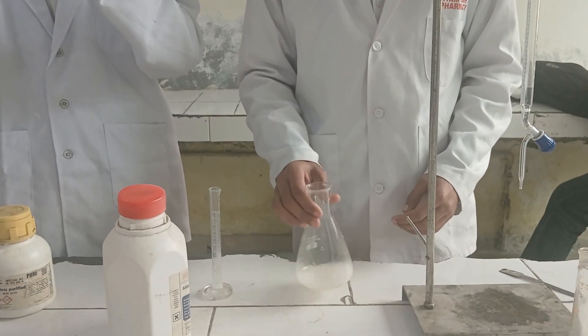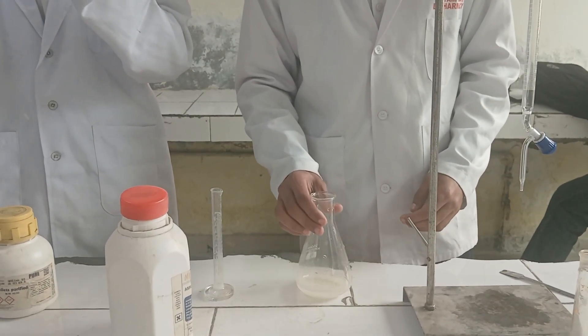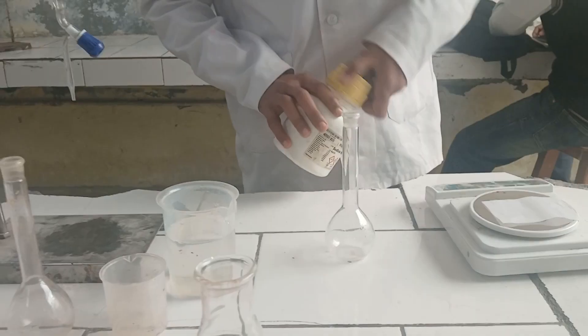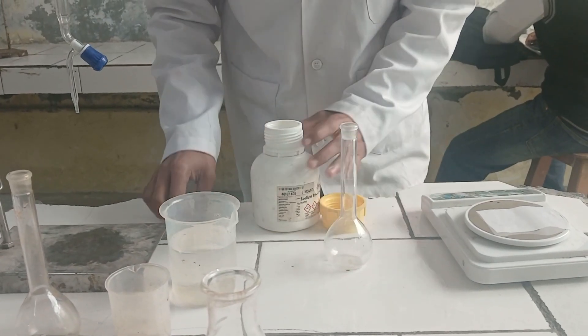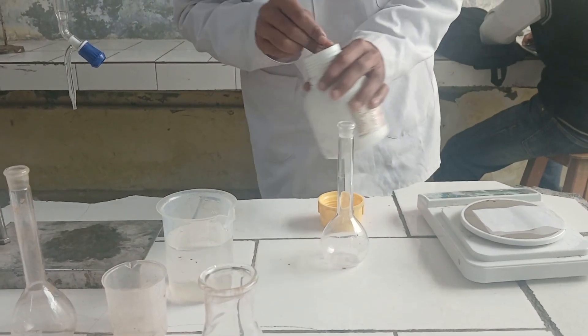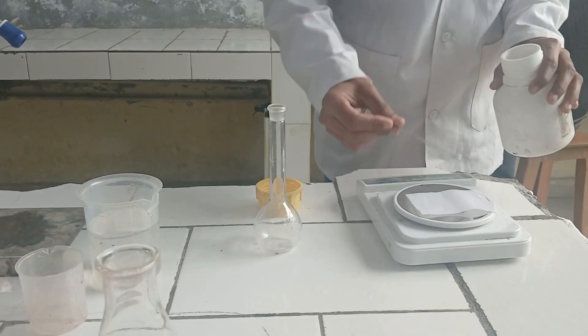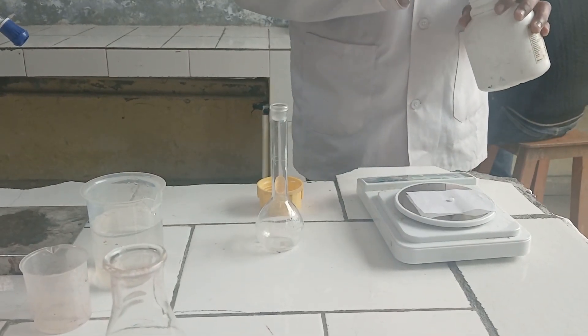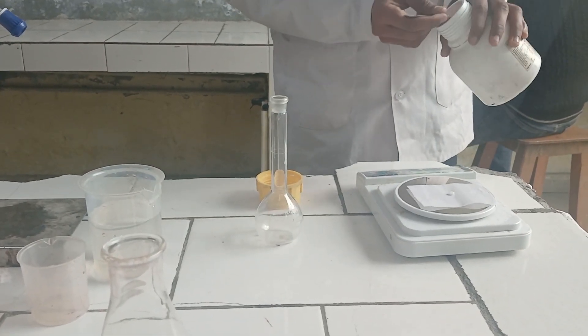In next step, we are making sodium hydroxide 0.1 molar solution for titration. We are weighing 0.4 gram of sodium hydroxide and make up the volume up to 100 ml.